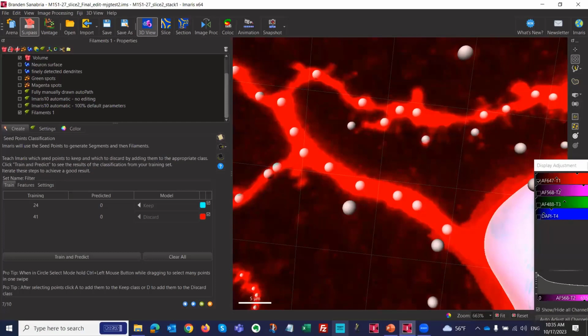If you just have 1 or 2 images, then yeah, you don't need to focus on that too much, probably. But if you really want to apply it later on 100 images, I would suggest spending a fair amount of time on these 2 steps just to make it as robust as possible. Then test it on the second data set and then retweak some of those, test on a third, retweak. And if it works for a few, 5 or 10, then I would be confident and apply it to as many others.